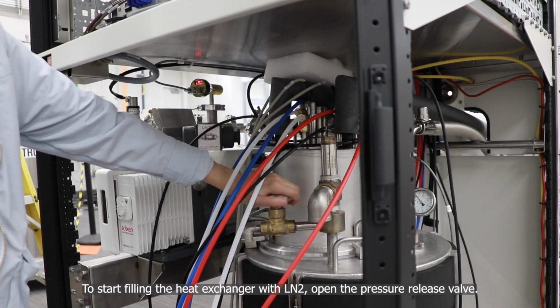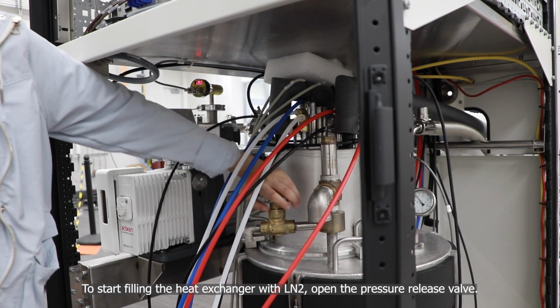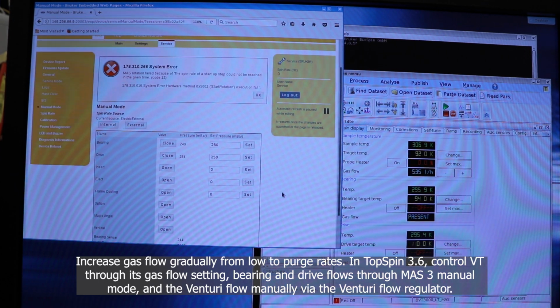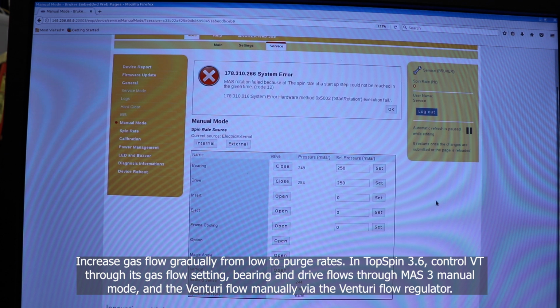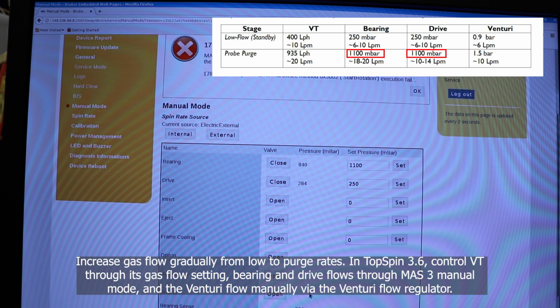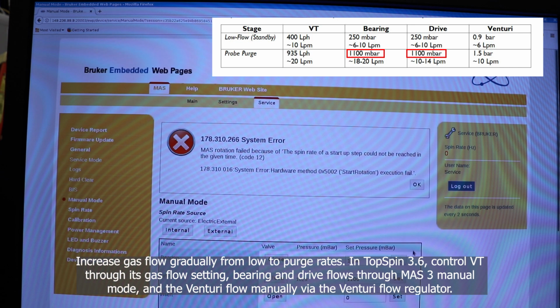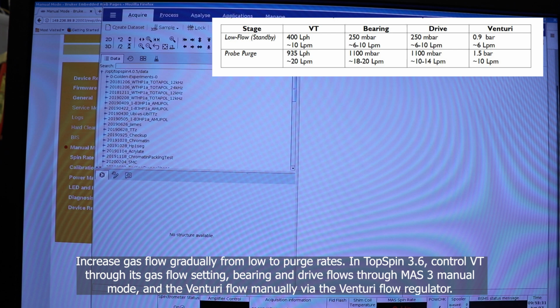To start filling the heat exchanger with liquid nitrogen, open the pressure release valve. Increase gas flows gradually from low to purge rates. In Topspin 3.6, where we control the VT, we increase it to 935. You can see the numbers on the screen. And the bearing and the drive, we increase to 1100, and the Venturi from 0.9 to 1.5.